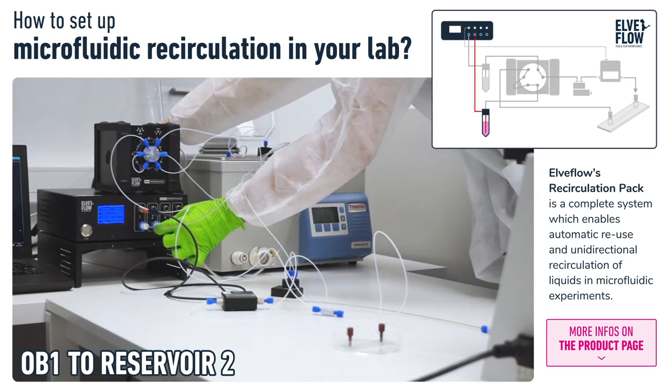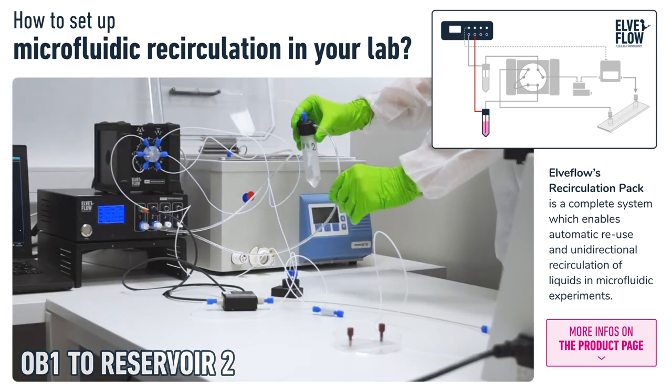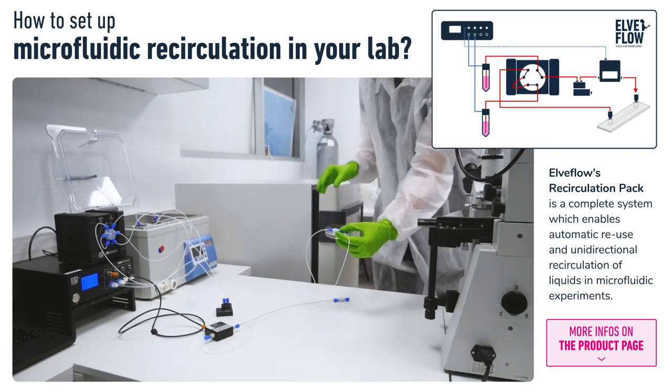Then we add the OB1 pressure controller to Reservoir 2. With this setup, we've cut the tubing long enough to move a chip between a microscope and a CO2 incubator without having to disconnect the chip.